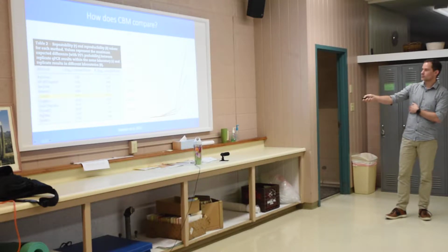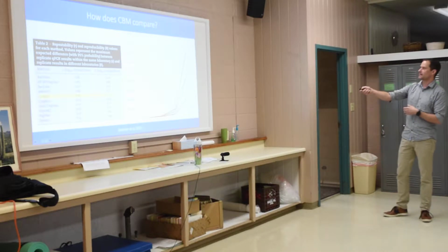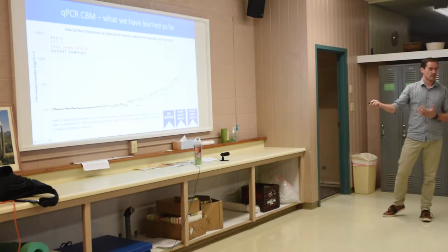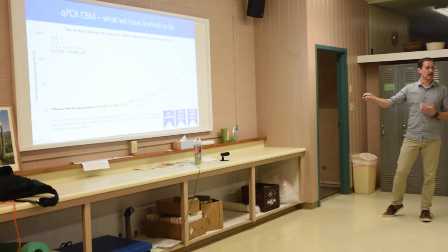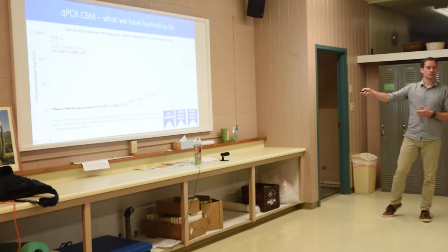So this lower one would be your lower variation. That would be the maximum lower variation you see in that sample. This is the maximum upper variation you see in that sample. It looks a lot like this, is my point. When we have higher copy numbers in our samples, we see higher variation, but they always track with the same relationship. We always see higher in both cases.